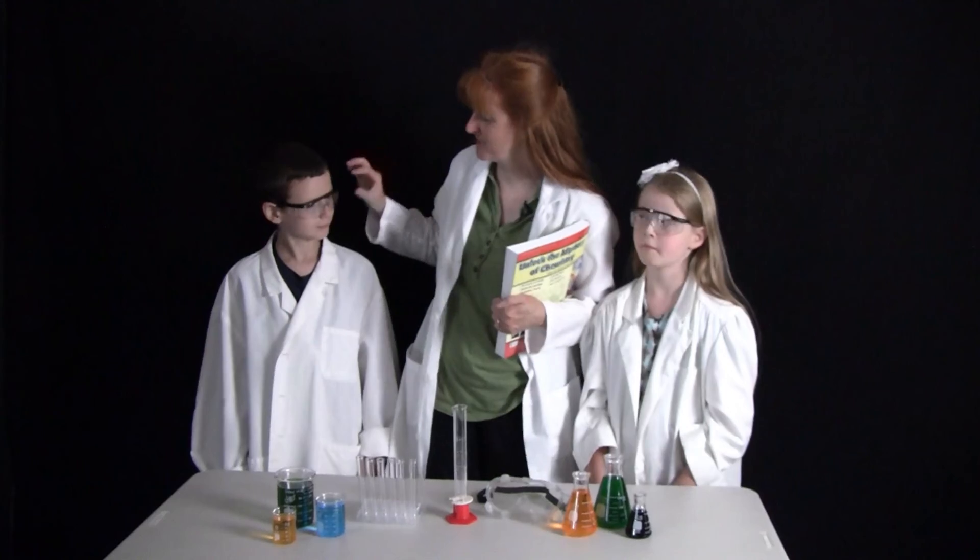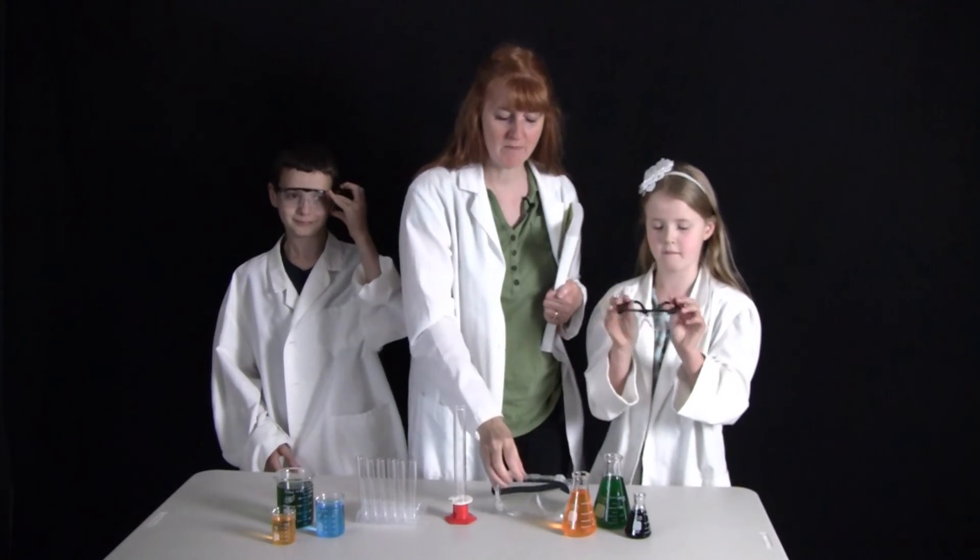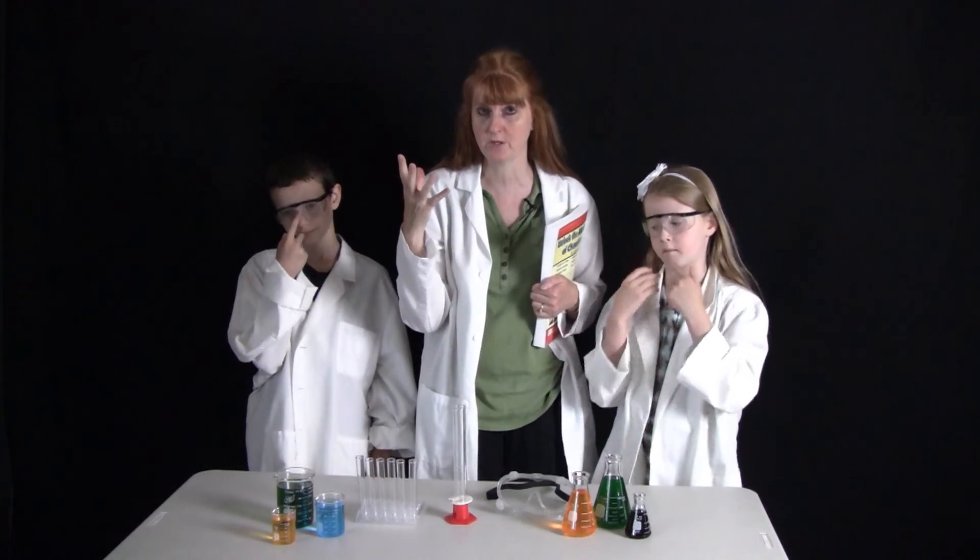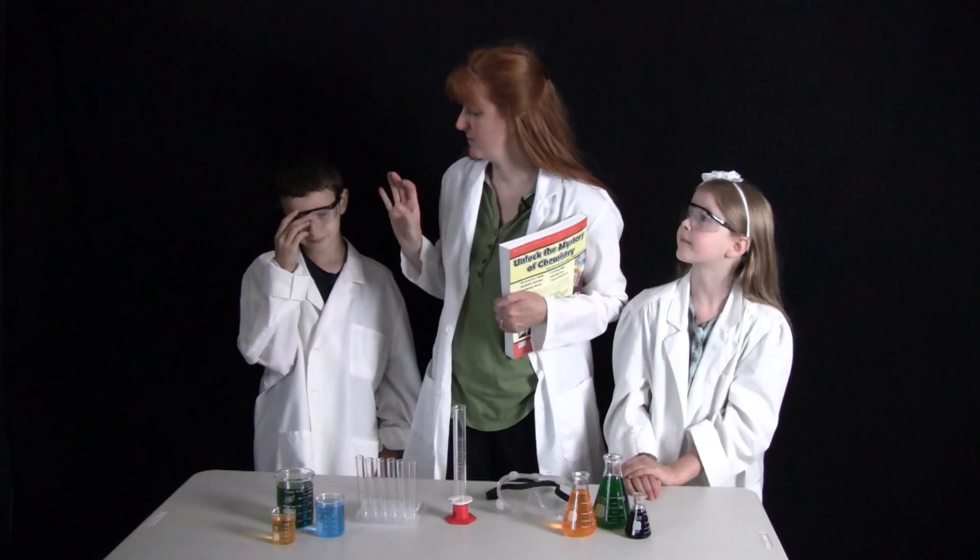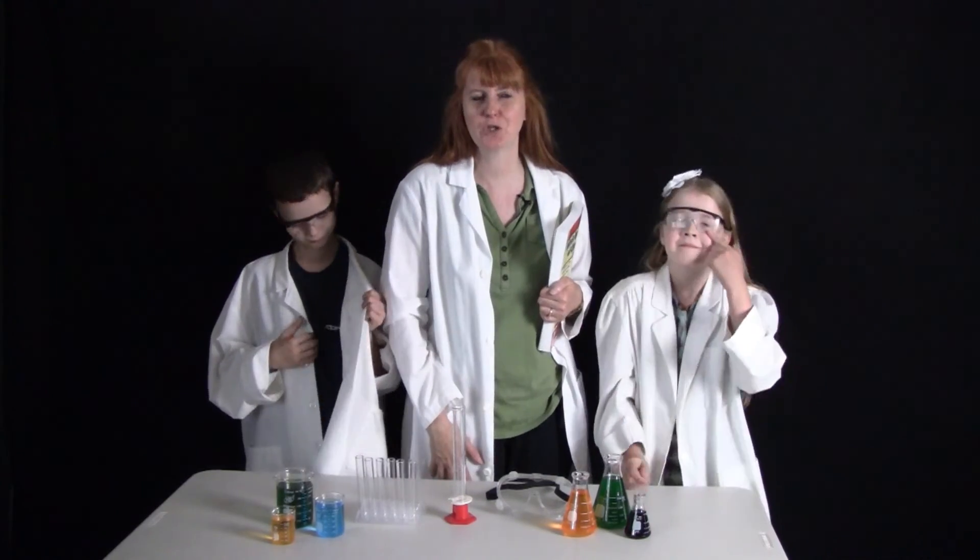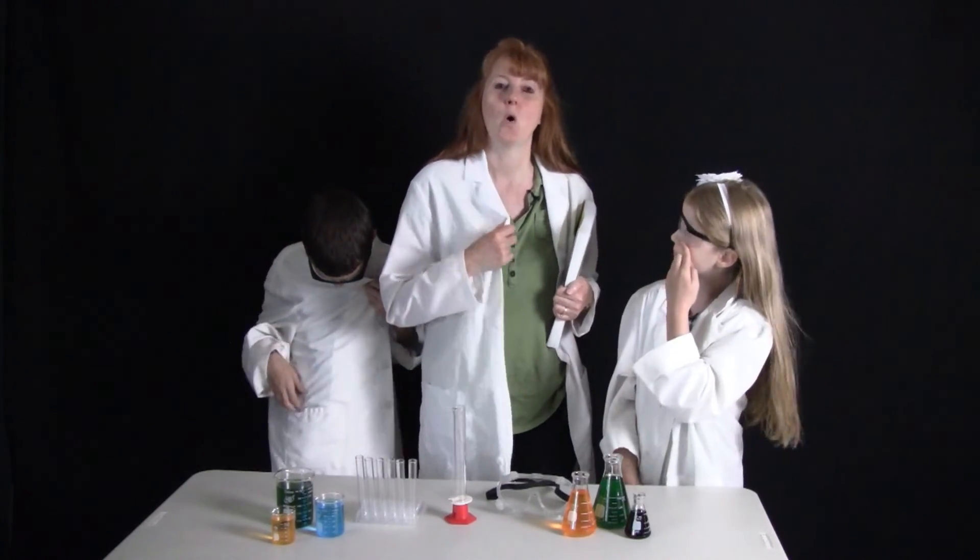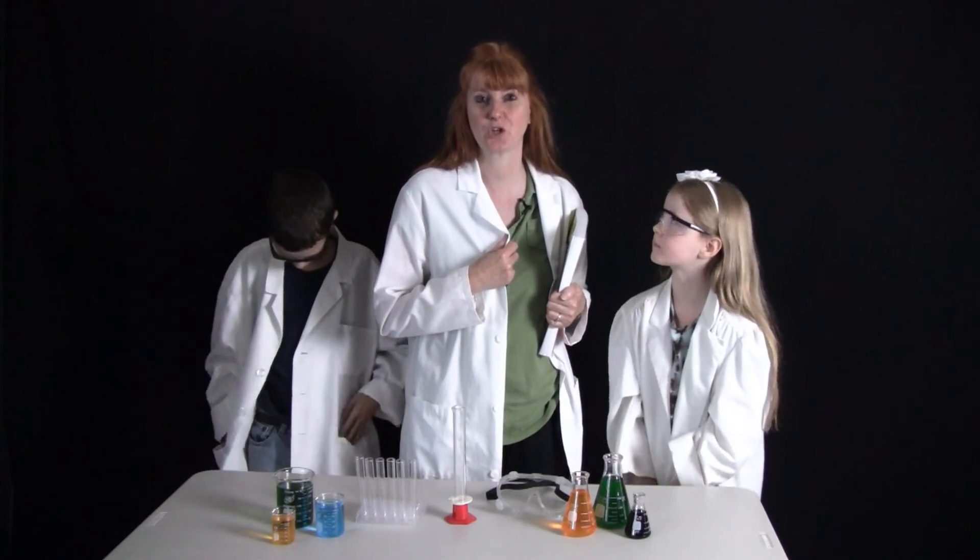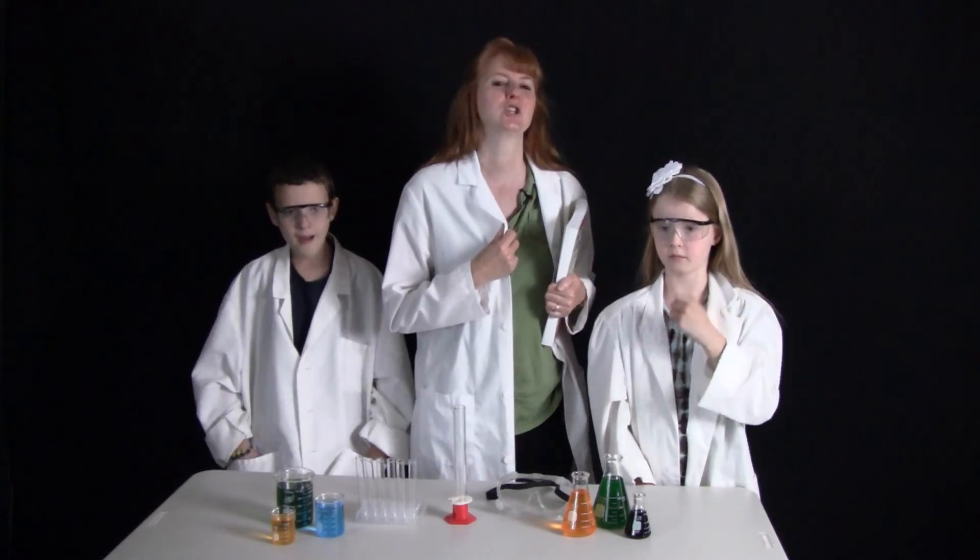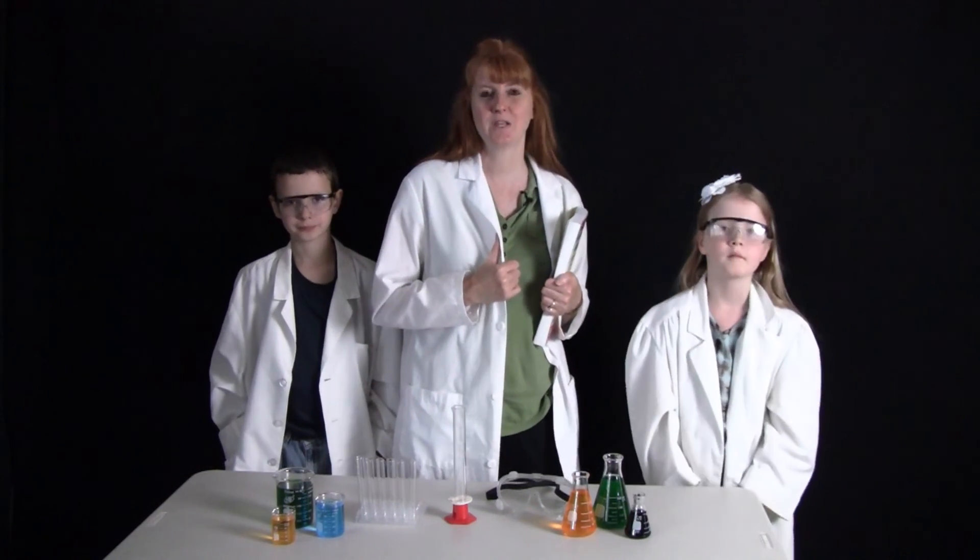You will also need safety glasses, which look like goggles like this, and that's to protect your eyes from getting stinging stuff into your eyes. You could actually go blind with some of the things that get thrown up into your eyes. So make sure that you wear safety goggles, safety glasses, excuse me. And also, you will want a lab coat. In a pinch, you could get that either at Goodwill from, these ones we got at Goodwill, or you can also get a shirt, like a white shirt, to use as a lab coat. You could also have a smock, especially if you have younger children with you. So, these are some of the chemistry tools that we are going to be using for chemistry.